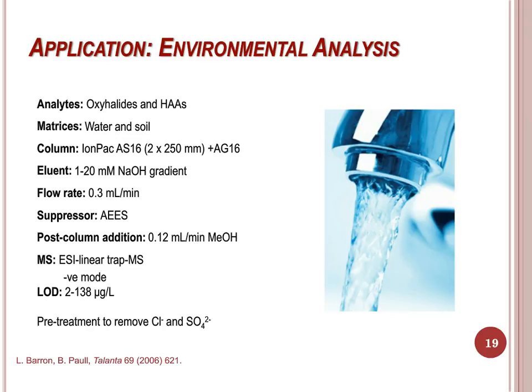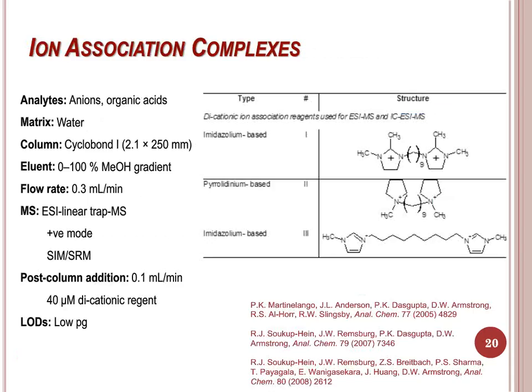Post-suppressor addition of an ionic reagent is set up in an identical way, except there will be an ion interaction reagent present in the organic solvent. The use of ion association complexes in mass spectrometry of low molecular weight inorganic ions has been documented over the past 15 years or so as a means to enhance selectivity, sensitivity, and in some cases signal stability. For ion exchange MS of anions, ESI has generally been used in negative ion mode. The use of ion association complexes with dicationic reagents has been demonstrated for anion detection in positive ESI mode.